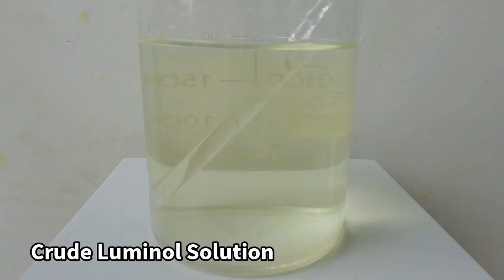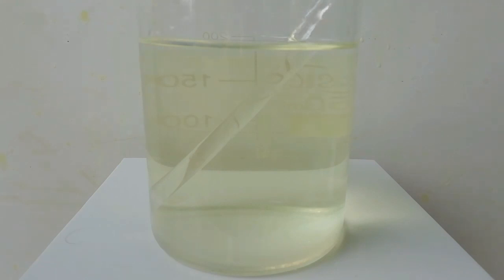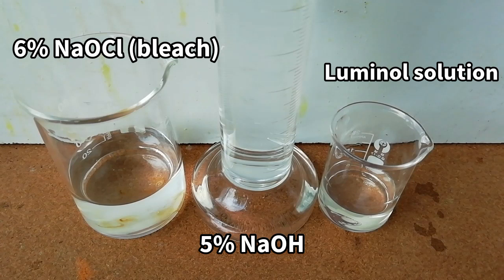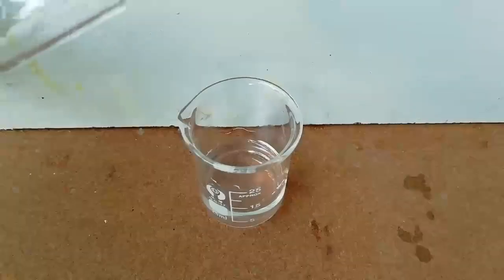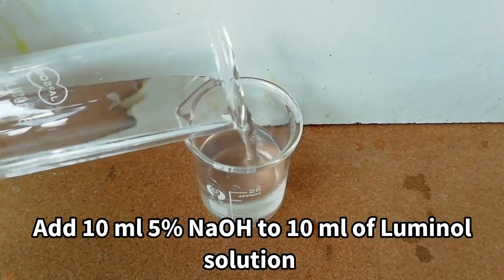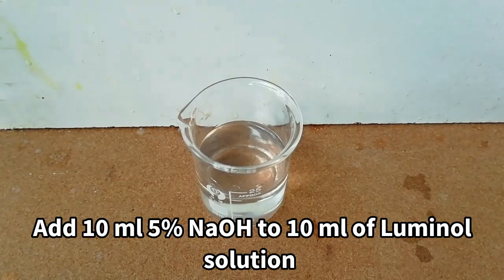To test the product we have already prepared we need sodium hydroxide, household bleach, and luminol solution. First I mix 10 ml of luminol solution with 10 ml of 5% sodium hydroxide solution. Now to get the glow add some bleach.